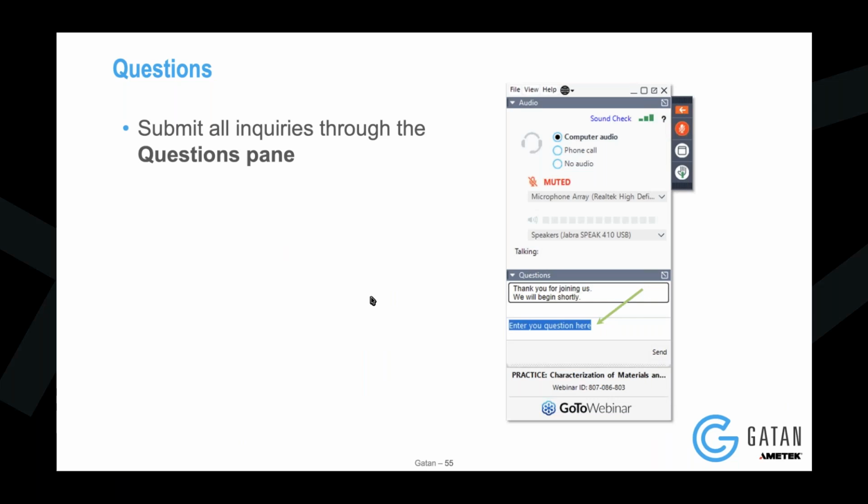Thank you. Another question was about the idea, once you start using custom scans, do you ever have a concern in some of these experiments and looking at the domain walls where maybe you miss certain dynamics in parts of the area that are not being scanned?